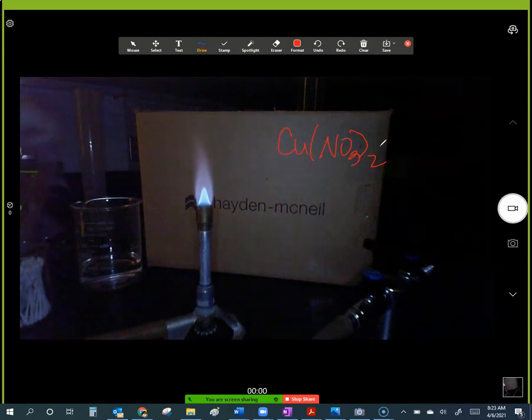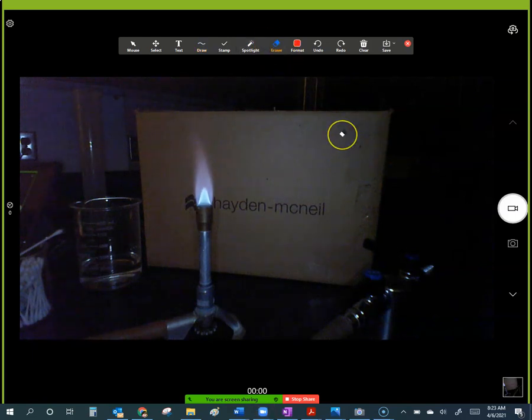The electrons are moving back and forth between different energy orbitals, right? And as they move, they emit photons, so the photons from the copper were emitted in the green light wavelength, which is about 500, I think, nanometers. All right. This next one we're doing is potassium sulfate.